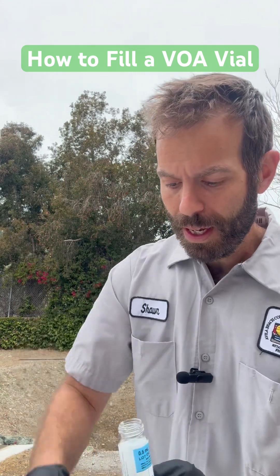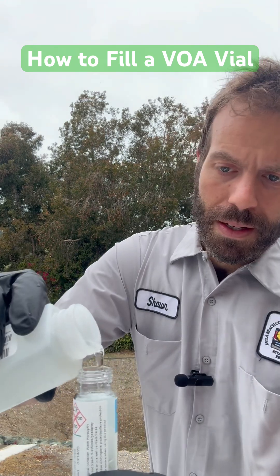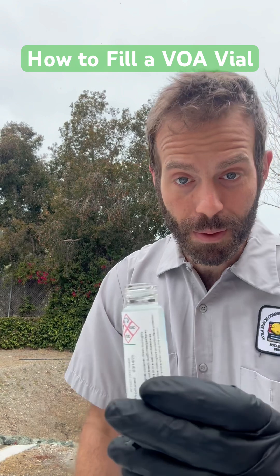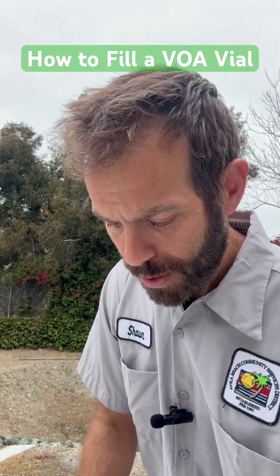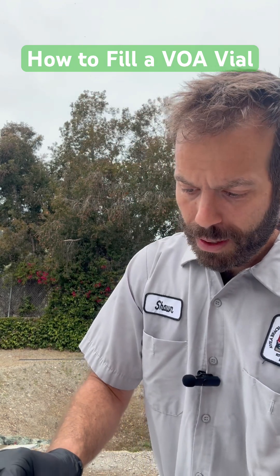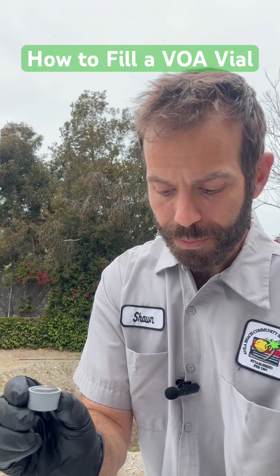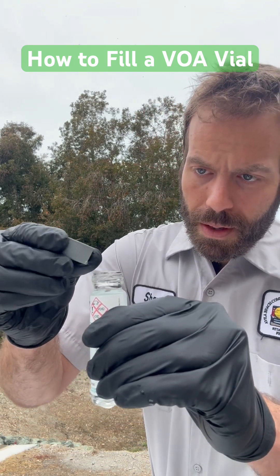My first step is to pour it to the shoulder carefully, just so long as I don't overflow the bottle — as high up as I feel comfortable. See how high that is? And now I'm going to do the zero headspace part of the sample. So I'm going to fill the cap full of sample and pour it right there.